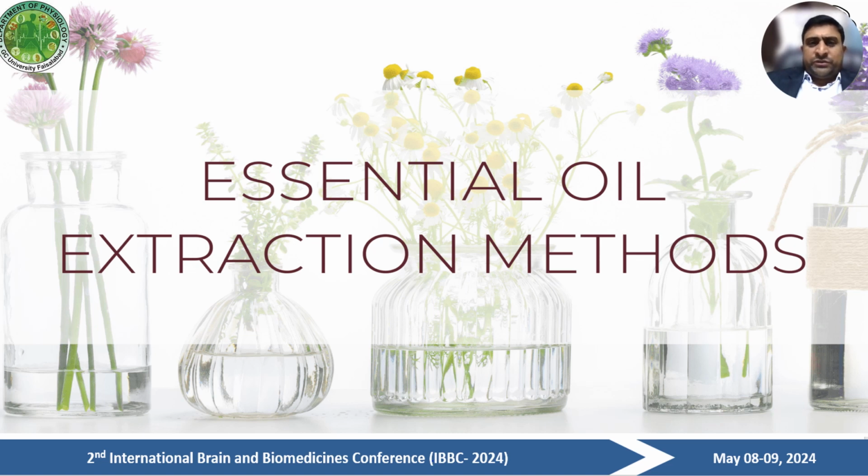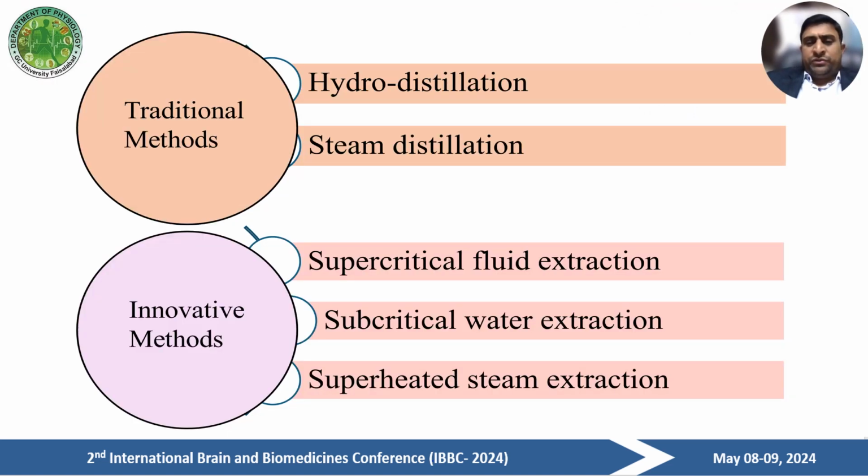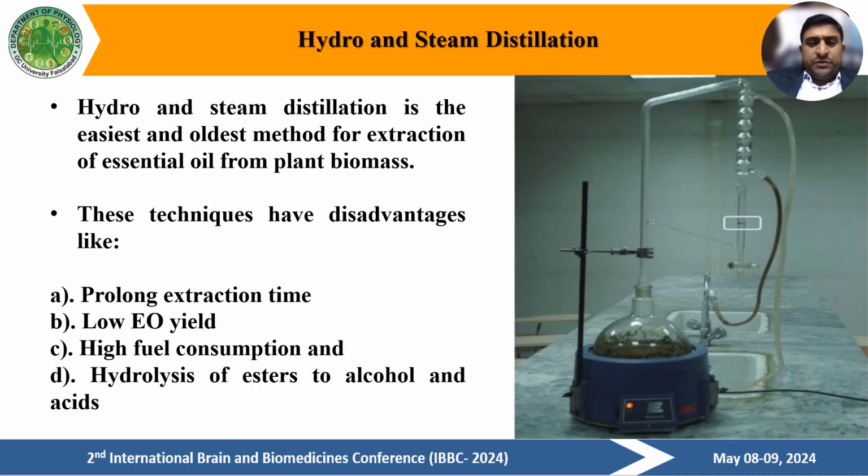Different methods are used for extraction of essential oil, like hydro distillation and steam distillation. These are traditional methods. Then there are supercritical fluid extraction, subcritical water extraction, and superheated steam extraction. This is a classical setup of hydro and steam distillation. Most of you already know about it, so I will not go into much detail about it.